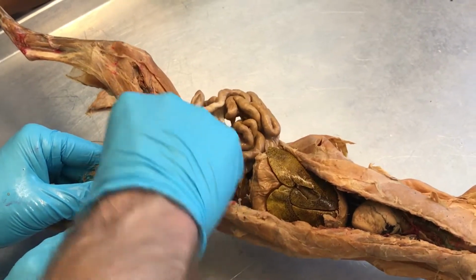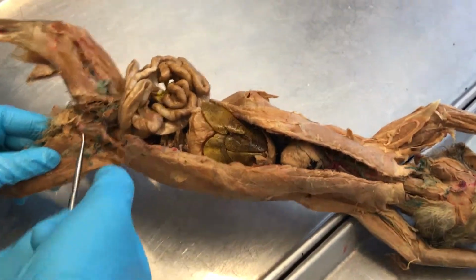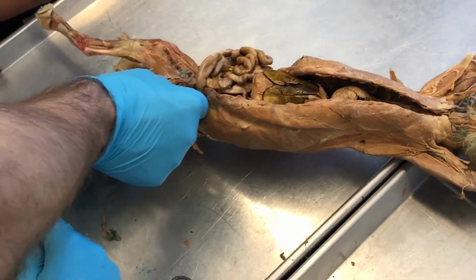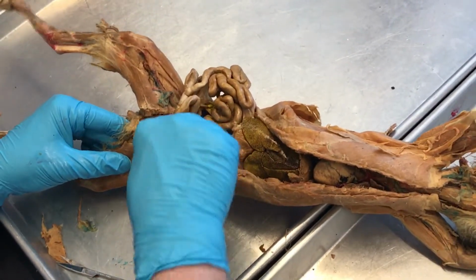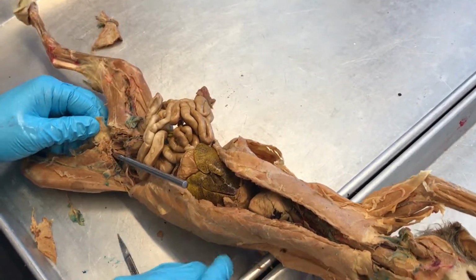Yeah. You should start right up at the uterus and go down to the vagina with a hand on each side, and then you can usually feel it kind of harden at the cervix. And then it should go to the outside, and that's the urogenital opening.